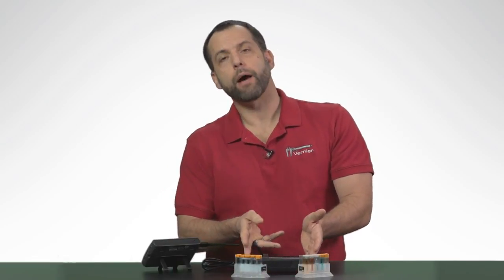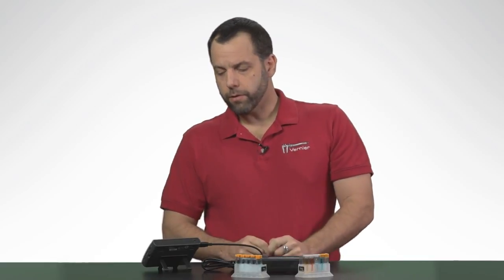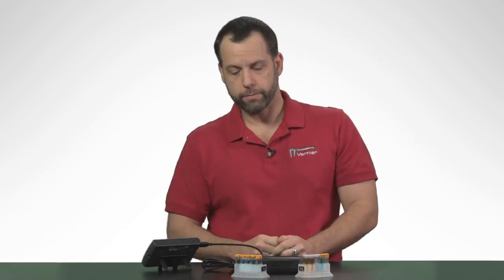This is one of the reasons why I really love this device — this lab can now be done in about two minutes, and then you can go on to do some very interesting inquiry-based activities. The other really interesting thing about this device is that it also is a fluorometer. A fluorometer measures compounds like chlorophyll that can absorb different wavelengths of light and then re-emit them — they'll actually glow. This is a really important concept in the biomedical field, and it's one of the reasons why plants are able to absorb energy from the sun and actually use it. I can show you how to demonstrate fluorescence very easily.